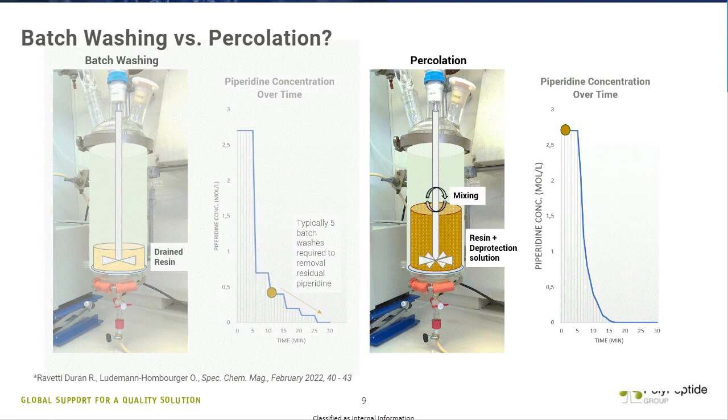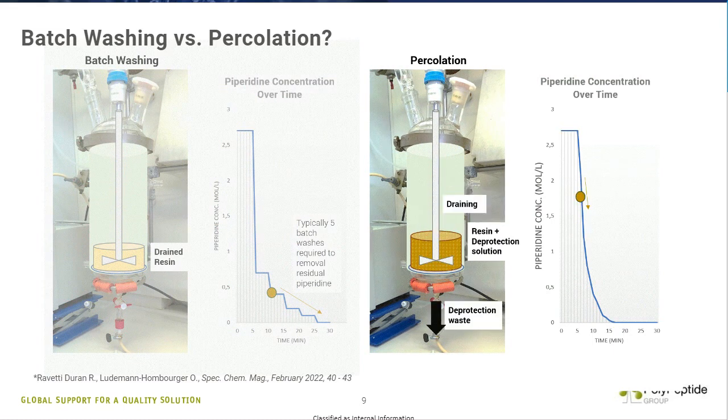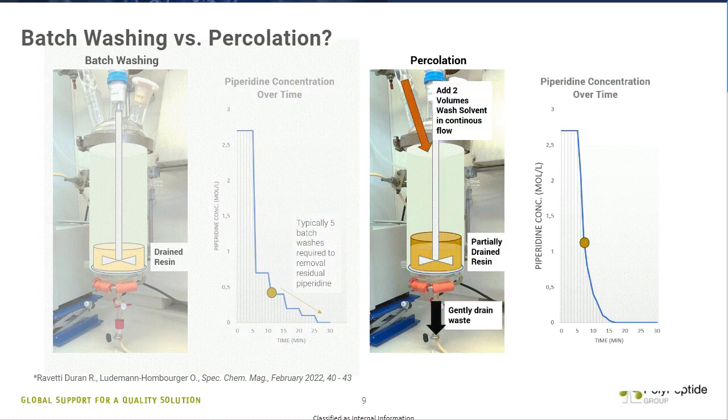Generally speaking, we're not implementing it after amino acid couplings, although it is now in consideration for certain campaigns. So it's something that we would, in certain cases, consider as well. But it is effective.